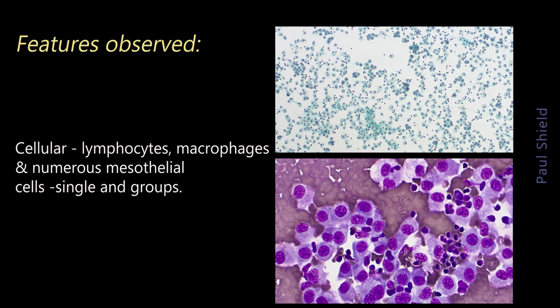Most of the cells appear to be mesothelial, and they showed typical mesothelial cell features, fairly homogeneous cytoplasm in a moderate amount with a typical NC ratio and cell size of a mesothelial cell. They showed really no cytoplasmic vacuolation, a little bit of degenerative sort of bubbly small vacuolation in the Diff-Quik, but certainly no hard-edged secretory looking vacuoles.